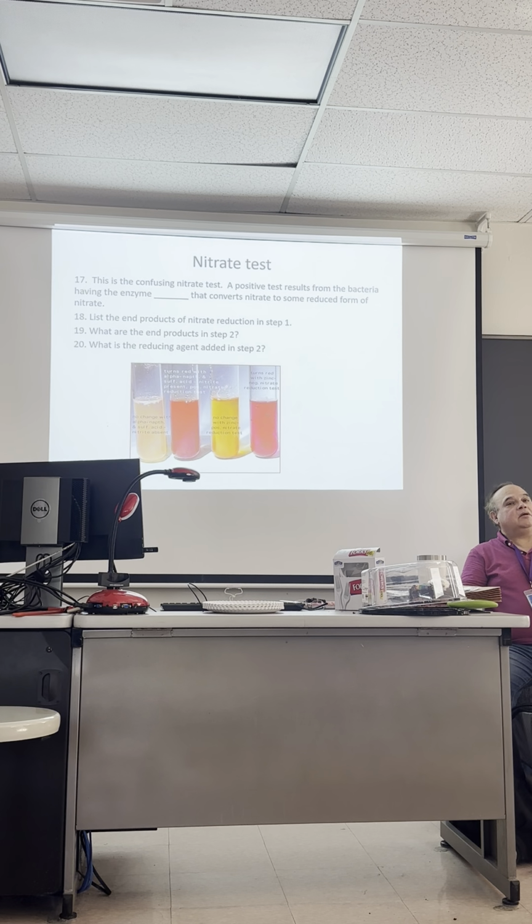If it turned sort of fuchsia, would that have been positive for nitrite? It doesn't, this one doesn't turn fuchsia at all. So that would have been an error. Well, maybe it might not be an error, Fatima. What might happen is maybe my color scheming is a little bit different than yours. But for this one, I'll use red, because there's no phenol red in here, so it's not going to be fuchsia.